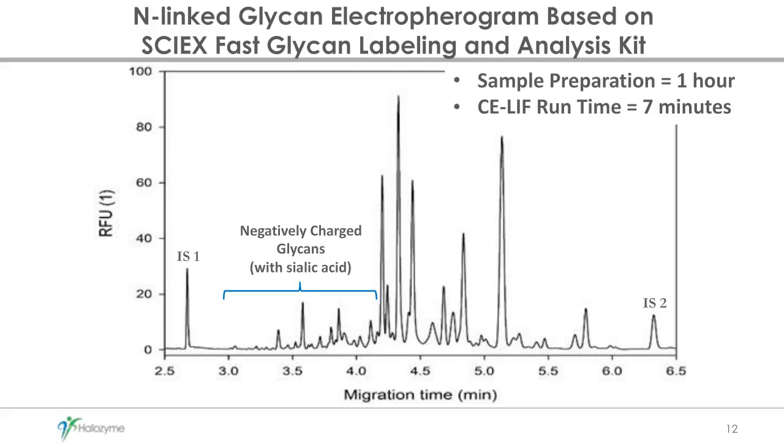Also, there is an internal standard. There are two internal standards that you include in your run. And this is actually really important. Of course, we use the corrected migration time for calculations. You need to have that.